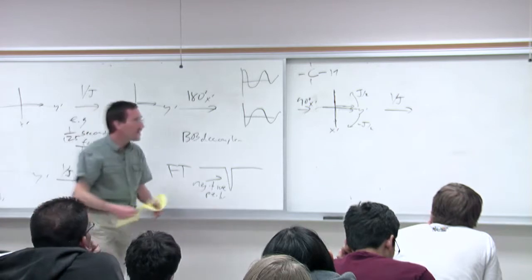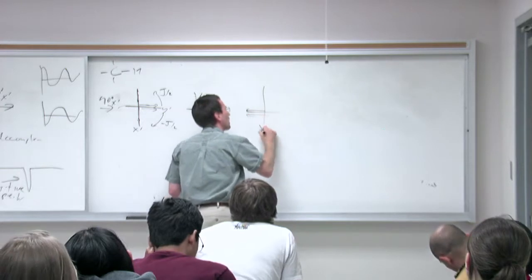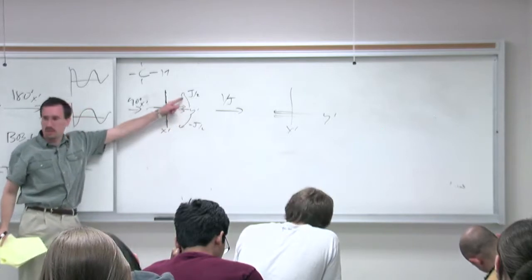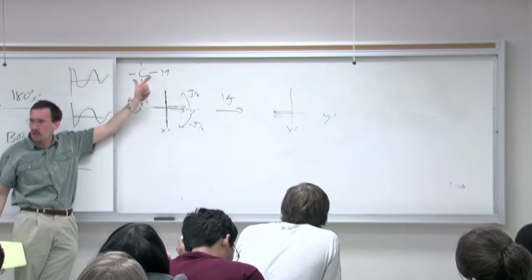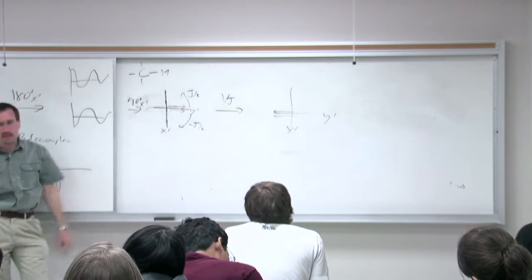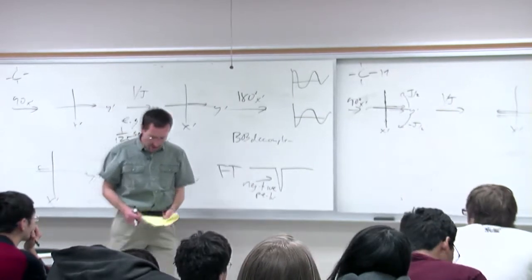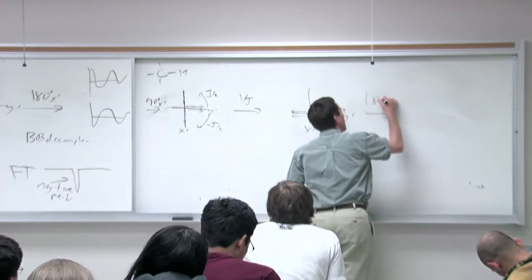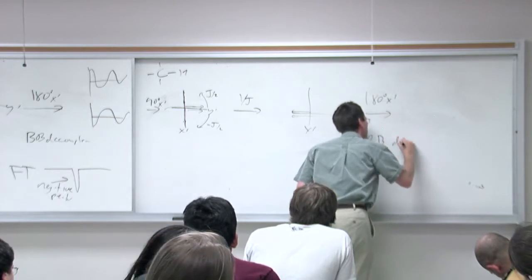And that's the main point over here, is now your two vectors, both the one precessing faster due to being attached to a spin-up proton, and the one precessing slower due to being attached to a spin-down proton, they've come by on the negative y-axis. Now, at this point, we go ahead, we apply our 180-degree X prime pulse, and we turn on our broadband decoupler.